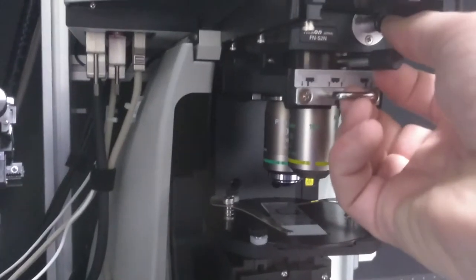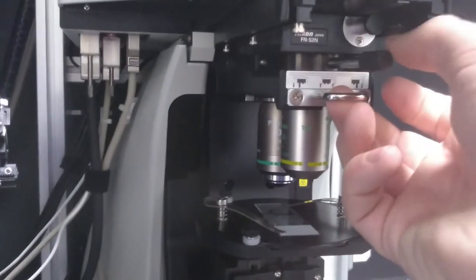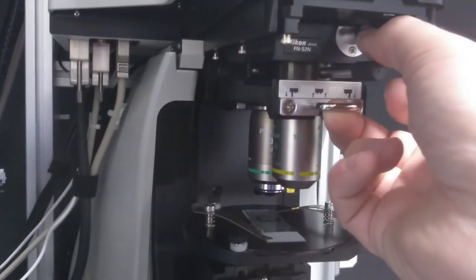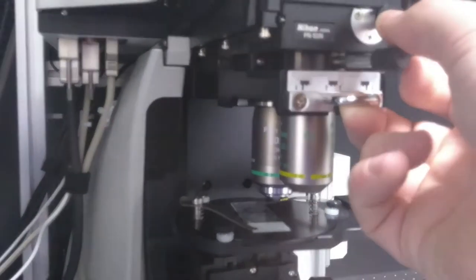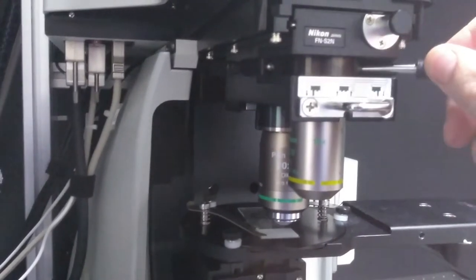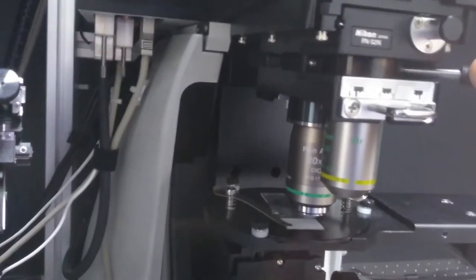If you need to change to the other lens, you have to depress this button at the front and pull the unit back, and then you can swing the other lens in place like this.